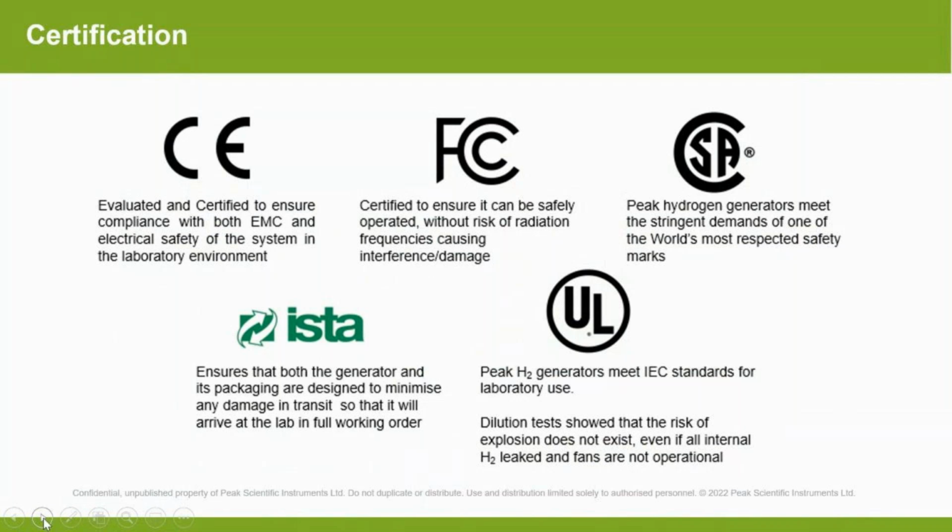What we had to show there was that if all of the internal volume of gas from the generator was to leak into the generator without the fans operating, we would not reach the lower explosion level, so that the generator really presents no fire or explosion risk. So it's just an important thing to look out for if you are shopping around for gas generators.